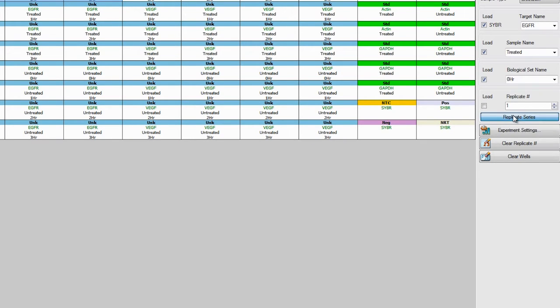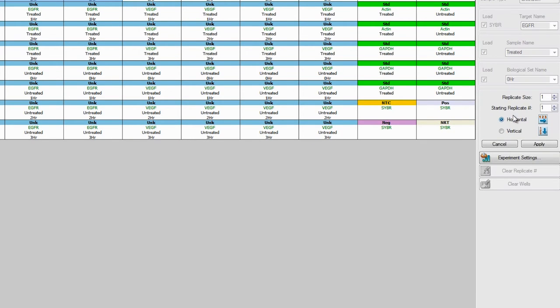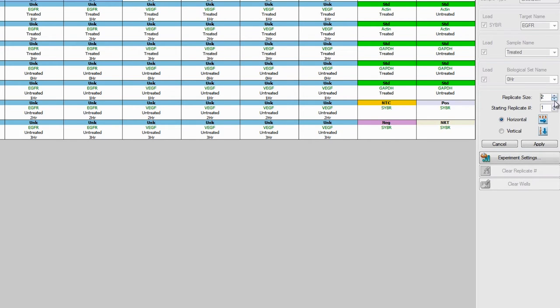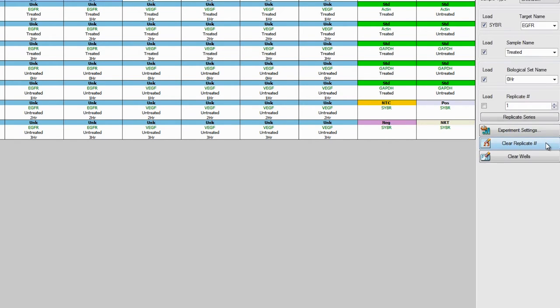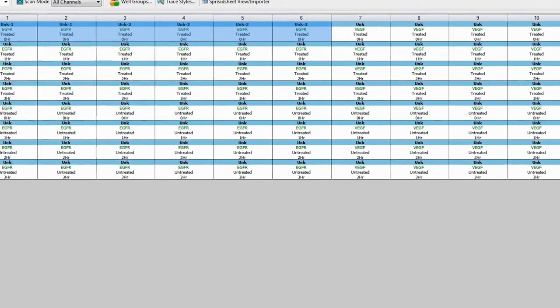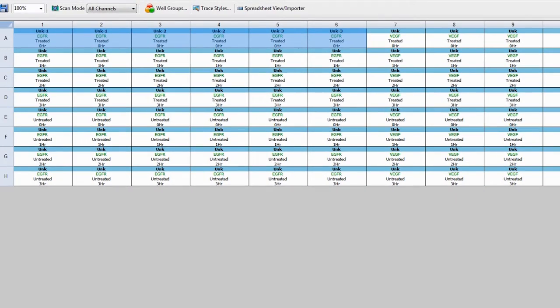Click Replicate Series. Input the replicate size, that is, the number of technical replicates per sample, in the Replicate Size field. Select the direction of the samples and click Apply. You should see the replicates propagate across the wells.